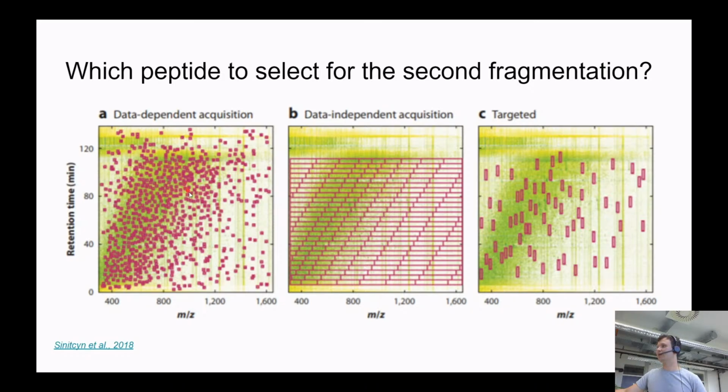One disadvantage is related to the reproducibility. So imagine that we took a HeLa cell line, digested it, we extracted peptides, and we prepared the sample, and we just split this sample into 2 Eppendorfs, and one Eppendorf we measured today, and the second we measured tomorrow. And the question is how the results are going to be different between these 2 measurements.